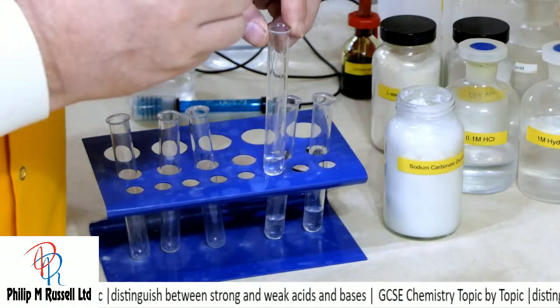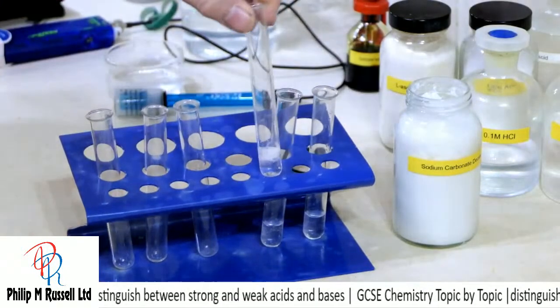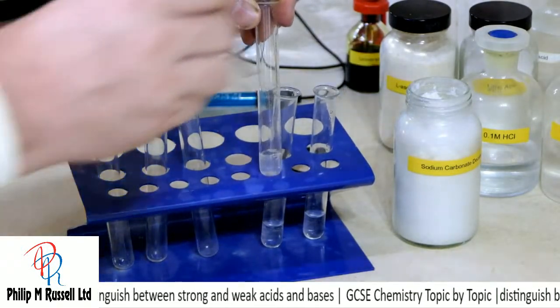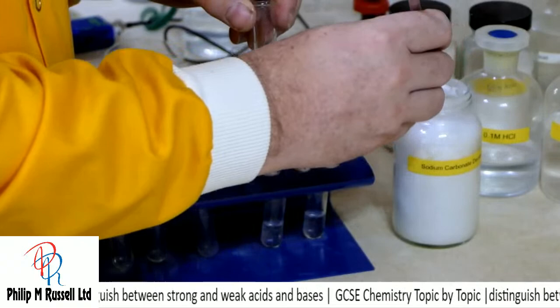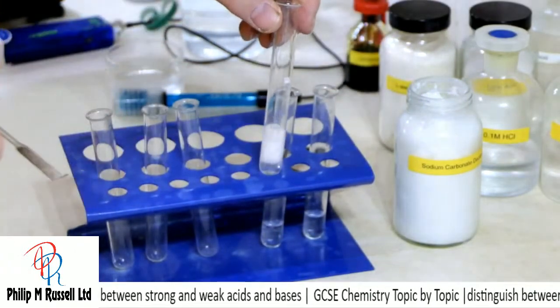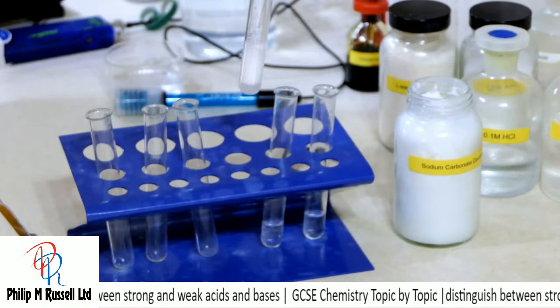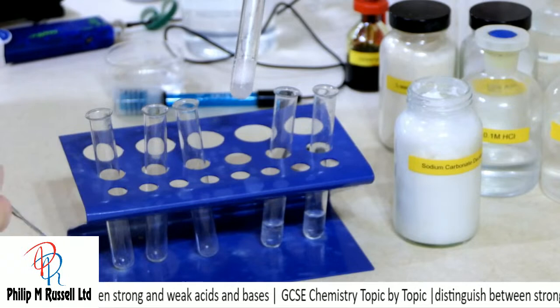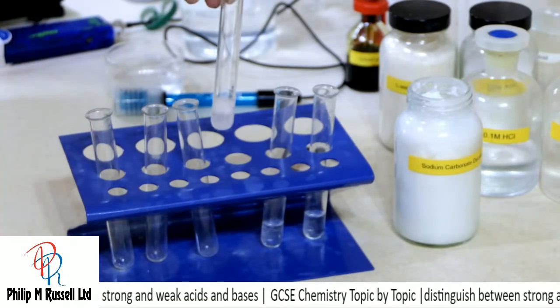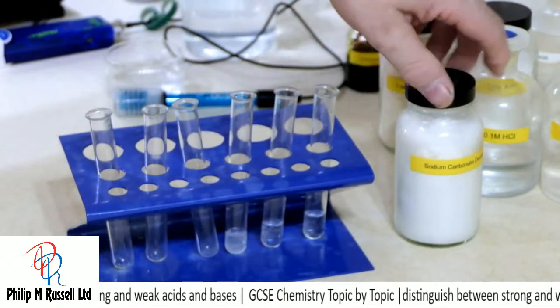So let's have a look at this one. Let's plunk it in. And not much difference here between the three acids. They are all reacting, put a bit more in, very quickly with this sodium carbonate. So they're all working really quickly.